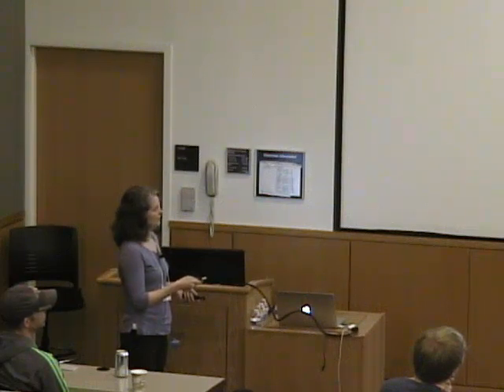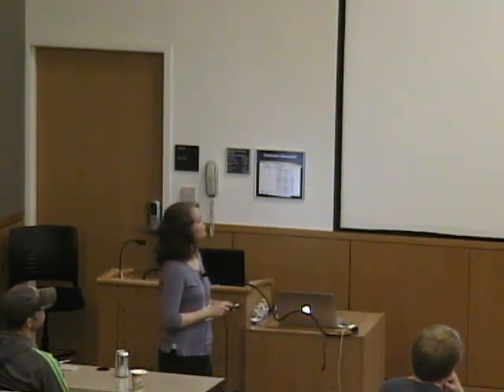All right, so in this paper, a collaboration between Alejandro Vila and the Bertini lab in Florence, they were able to detect these two peaks indirectly in a really cool experiment. I really love this paper. It has a really nice explanation and discussion about electron relaxation as well. So what they did is they made a 1-to-1 mixture of copper-1 azurin and copper-2 azurin. Copper-1, of course, is d10 diamagnetic, and then we have our paramagnetic copper-2. And you have an electron exchange between these two.